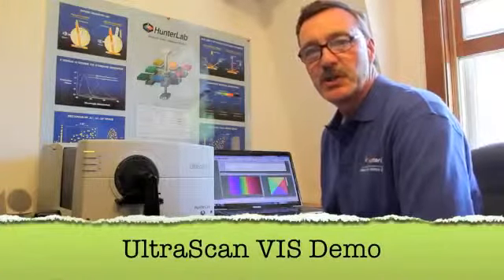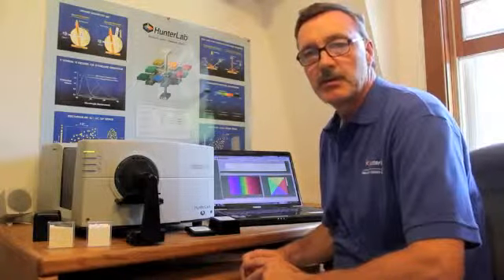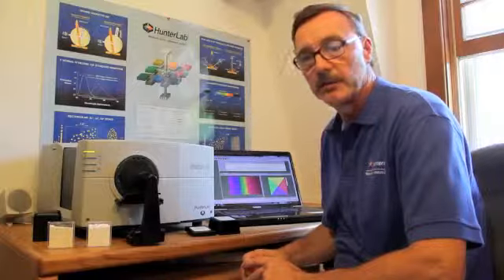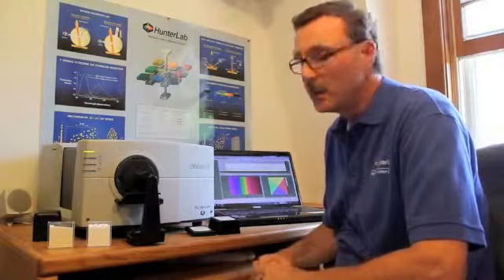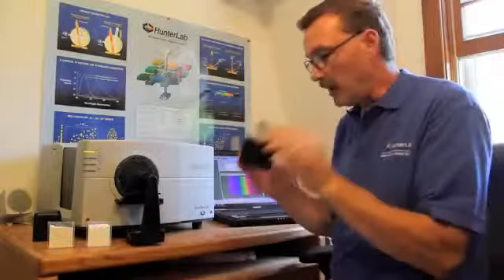In this demonstration, we'll be measuring the reflected color of powders. Powders are a very common application for HunterLab, measuring color in reflectance. We first standardize the instrument. I use both the black and the white tile.